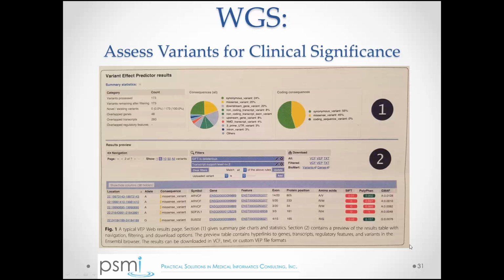You wouldn't want to say, oh, well, the variant effect predictor said that this was a non-pathologic variant, so therefore it's non-pathologic, or the variant effect predictor said that this is a pathologic variant, so therefore it's pathologic. You certainly can't use them this way. The way we're using them is as a filter to then further explore the subset that we're interested in, realizing that we may have just removed the actual culprit.